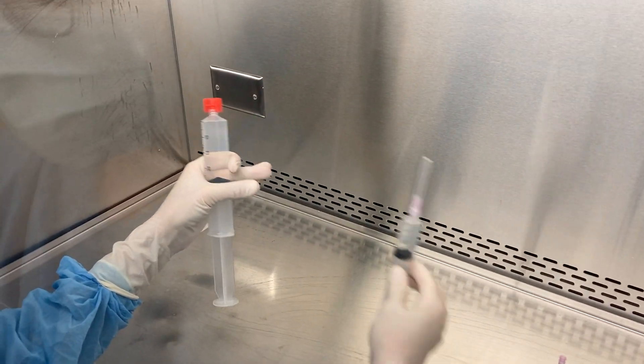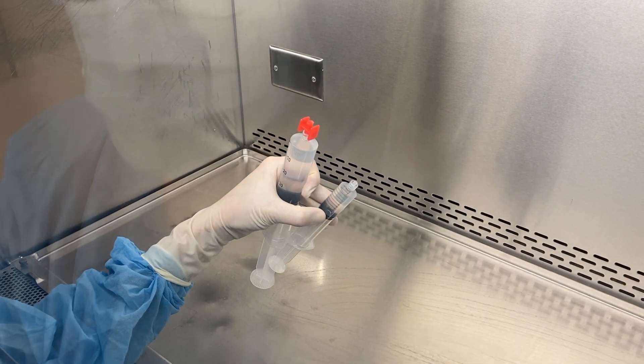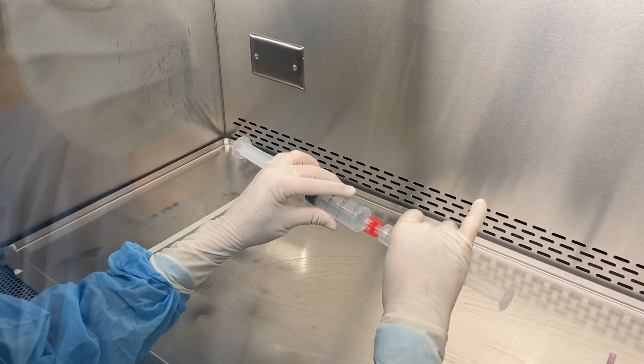Remove all the packaging. Grab my other syringe, remove the needle, and attach it to the other end of the RapidFill connector.